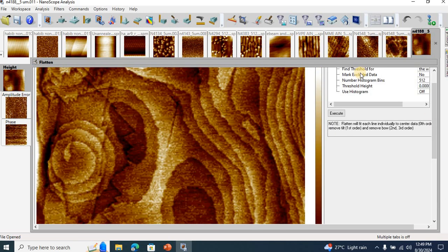That concludes the session for today. So that's a wrap on our journey through the Nanoscope Analysis software. I hope this tutorial has given you the confidence to dive deeper into your AFM data and extract the insights you need.